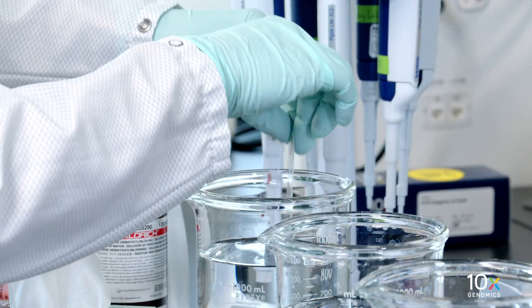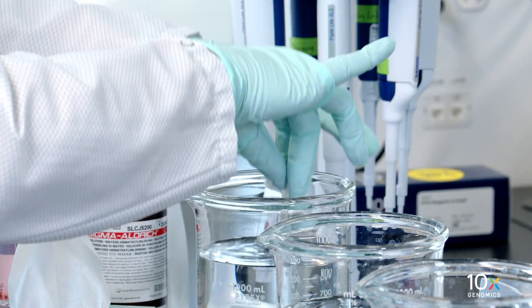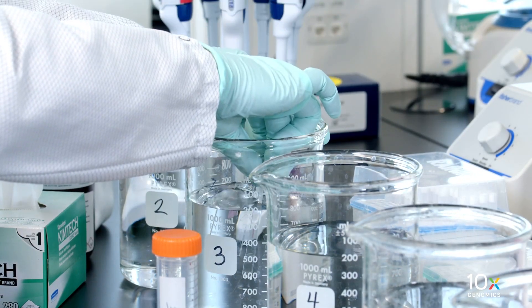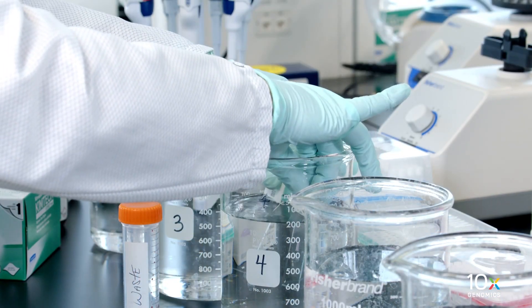Dip the slides 5 times in beaker 2. When dipping the slides, ensure that the sections are fully submerged. Dip the slides 15 times in beaker 3. Dip the slides 15 times in beaker 4.